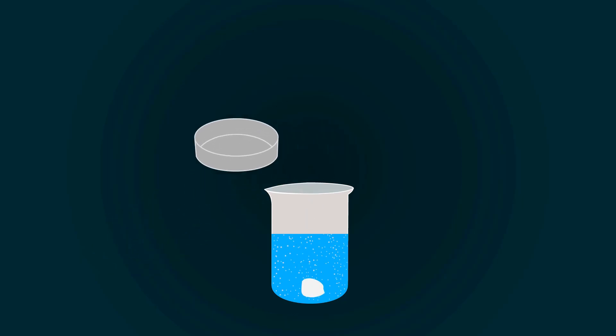In this video, we will learn how to prepare a 10% solution of potassium hydroxide.